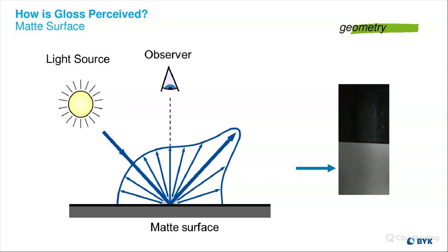Now, when we look at the matte side, that matte surface, we again have all that light scattering, and so now it's going to create this diffused look, and in turn change how that measurement is going to take place with a 45-0 geometry. So we see a clear difference in what that color looks like to us based on that surface texture. And that's the big difference with the 45-0 geometries, because that's going to measure that difference. Whereas the sphere geometry is designed in a way to where it doesn't measure that difference. And we'll talk about that later on.